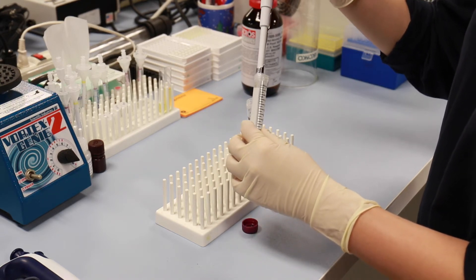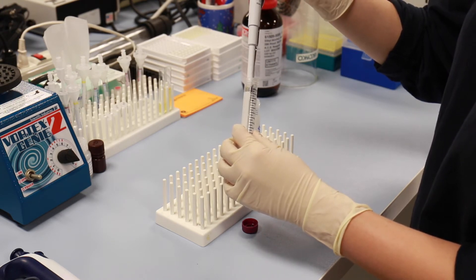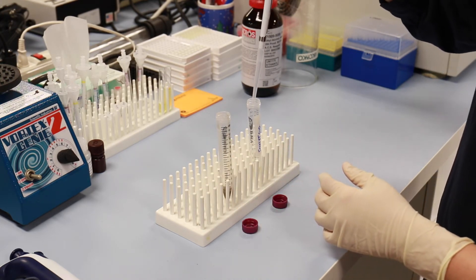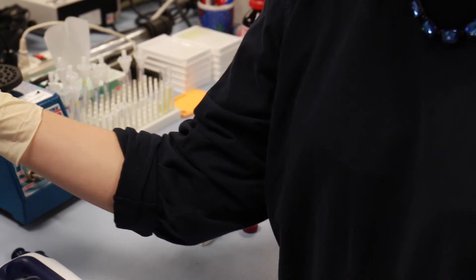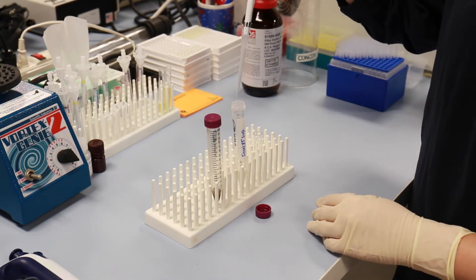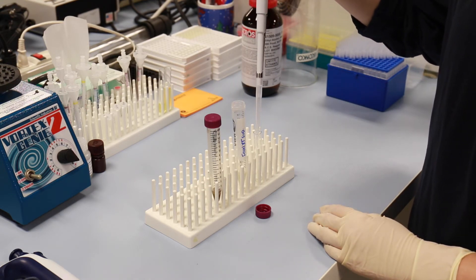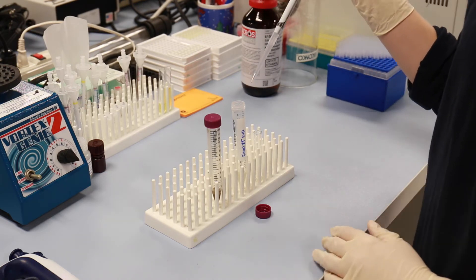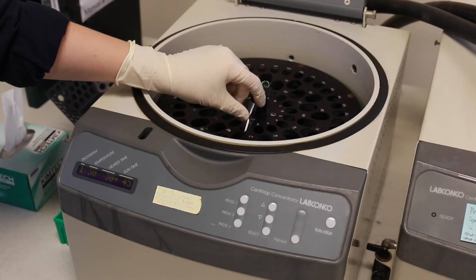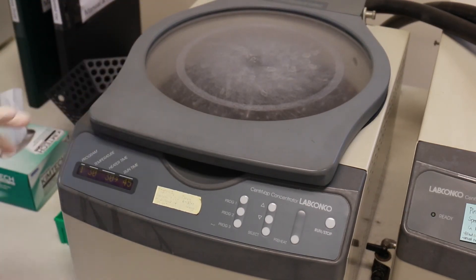Ethanol supernatants can be evaluated directly in the steroid assay kit. Refer to the kit manual to ensure the minimum dilution is carried out to reduce any interference from the organic solvent. Typically this is less than or equal to 5%. To measure the steroid content from a dried-down sample, first transfer a measured volume of the organic supernatant to a clean tube for evaporation. Evaporate the solution to dryness in a centrifugal vacuum device such as a speed vac or under nitrogen.